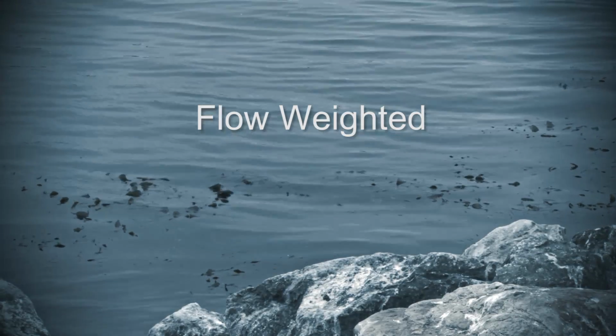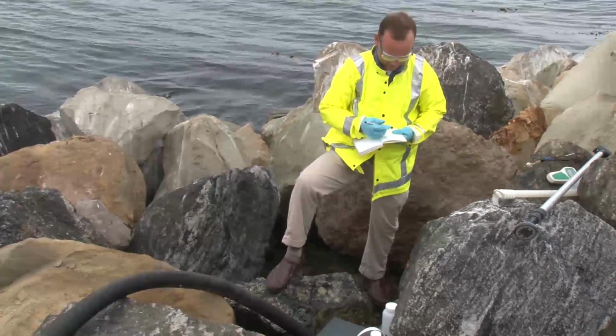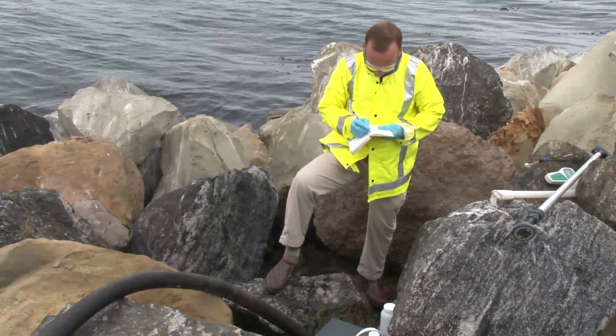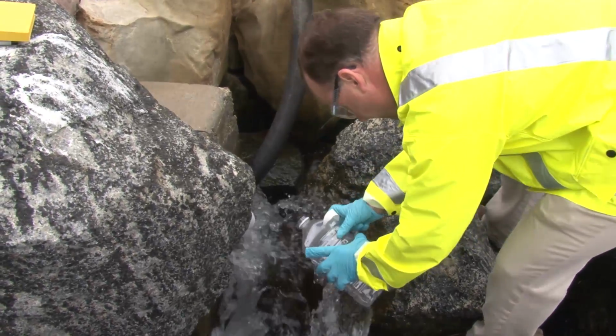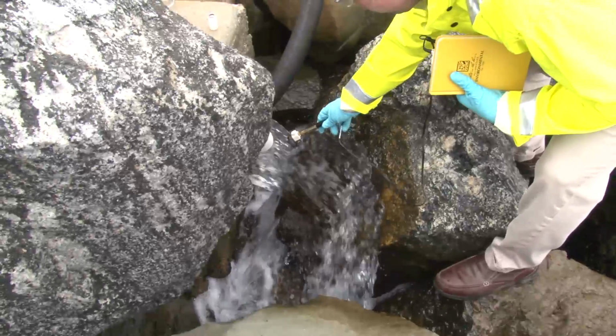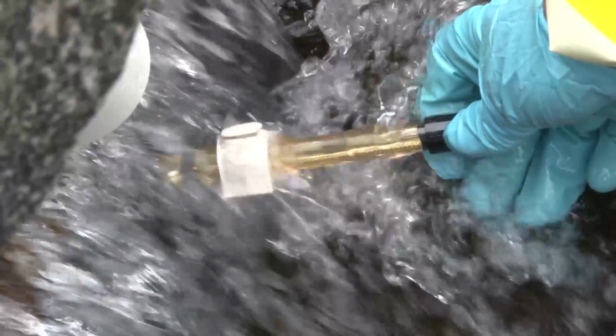Obtaining each collected sample consists of 5 separate steps. First, obtain and record stream flow rates. Next, obtain the stormwater sample. Begin collecting samples 20 minutes after discharge begins. Once you have the sample, collect any required field measurements. At a minimum, you should collect pH.